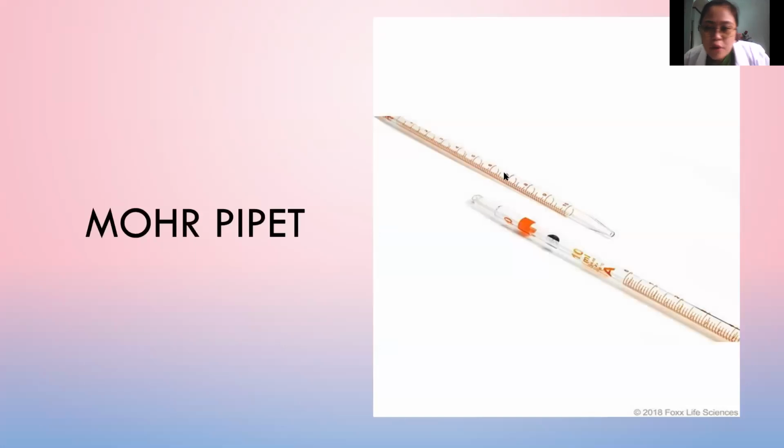So this is how a Mohr pipette looks like. It has calibration from 0 to 1 to 10 ml here. So this is a 10 ml Mohr pipette and it can deliver variable volume. So if you want to deliver 2 ml, you just have to let the liquid flow until the lower calibration line. So that's 2 ml.